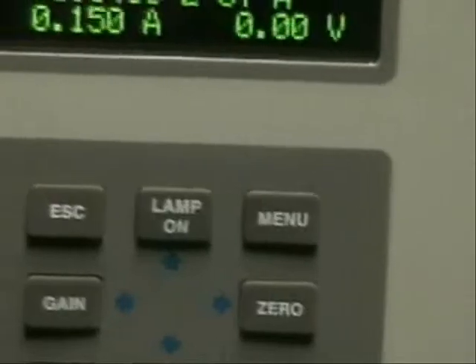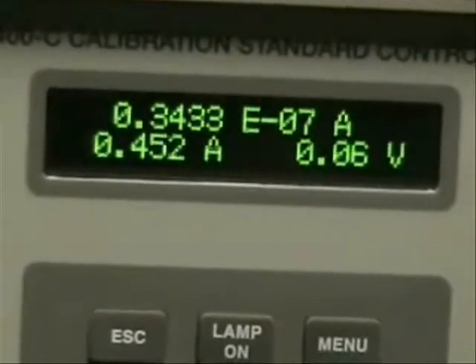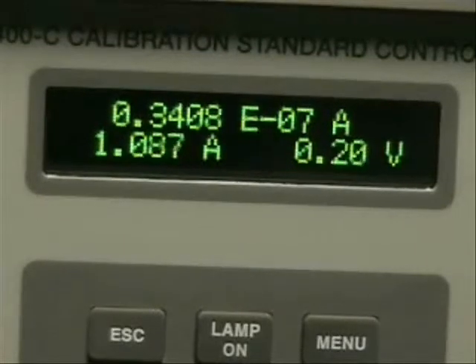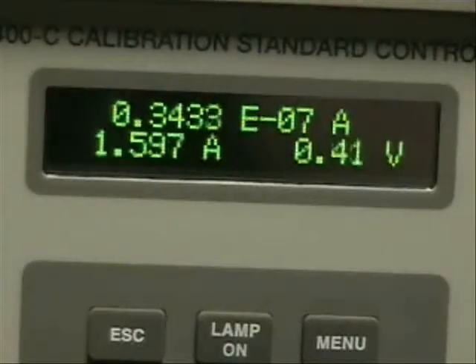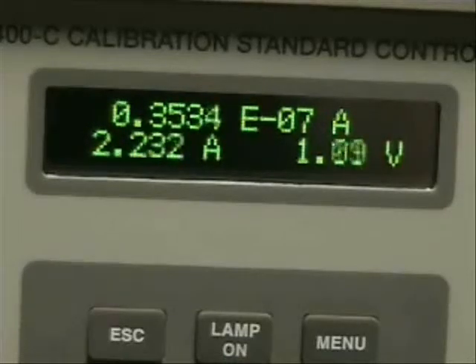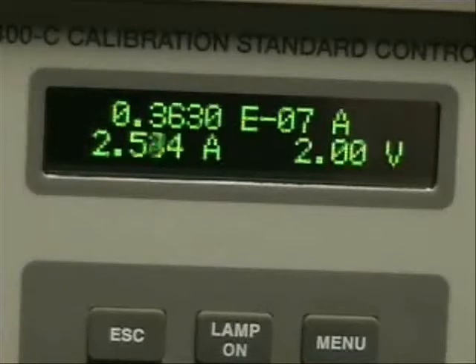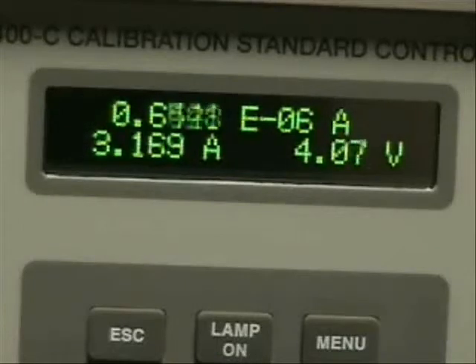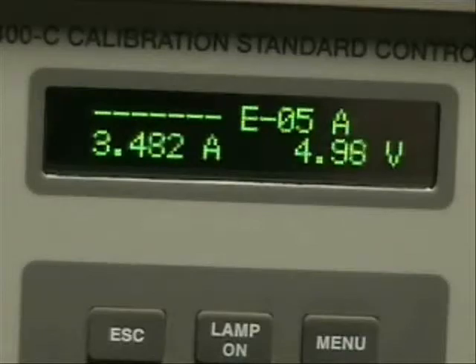Everything is preset from the factory, and you'll see the current start to ramp. We're now approaching one amp, and that'll ramp up to about 5.3 amps, which is preset from the factory. The top numbers are a read of signal, the bottom number in amps is the current being applied to the lamp, and the voltage shown is also the voltage applied to the lamp. Moving over to the optics head, we can see that we're getting some light out now.